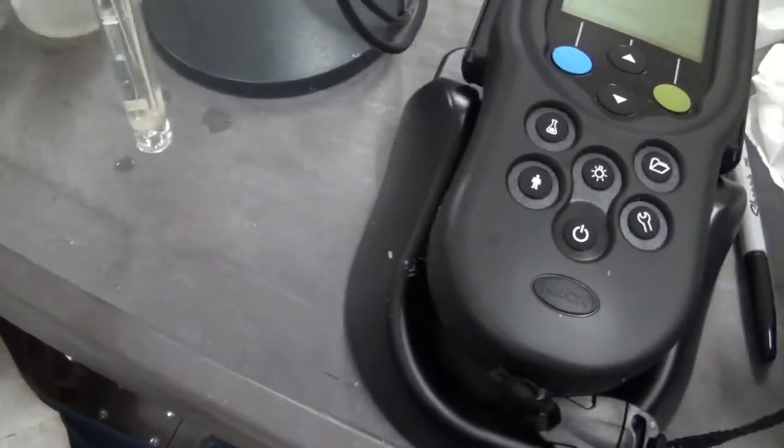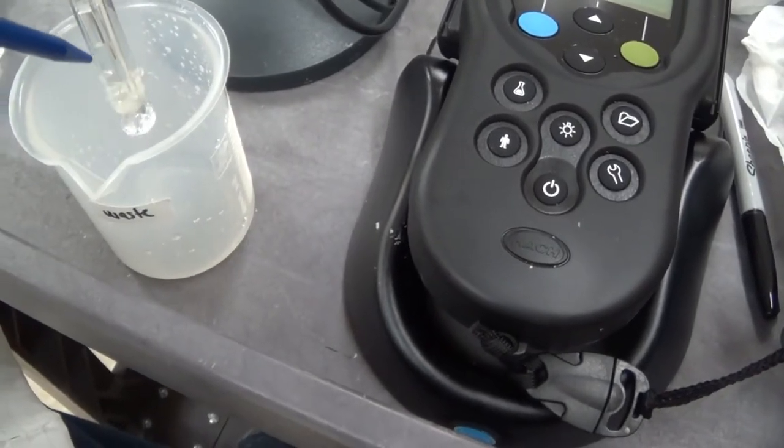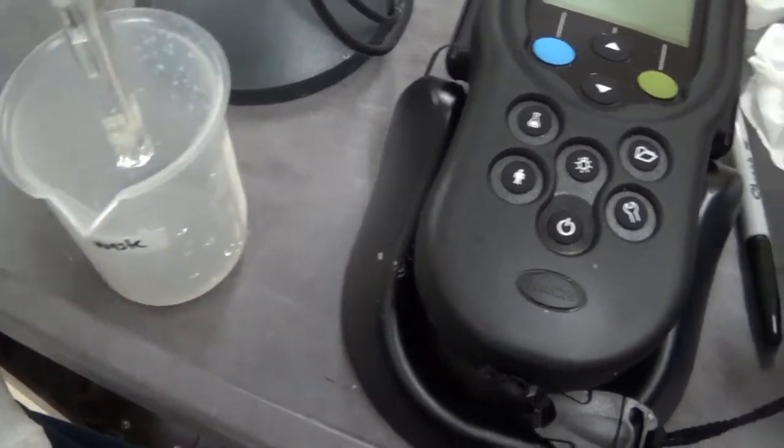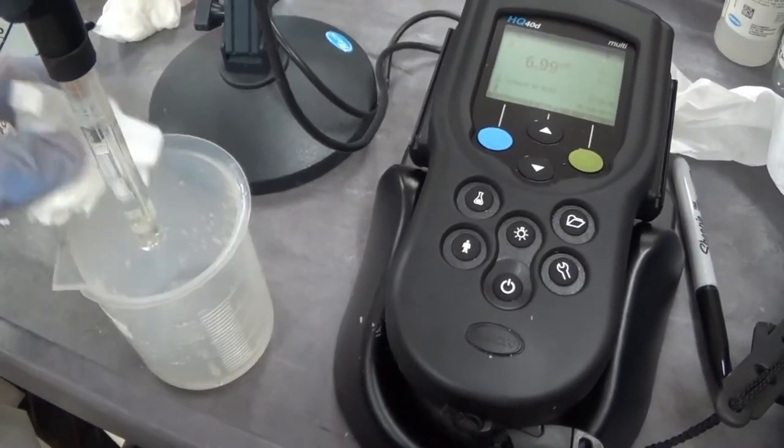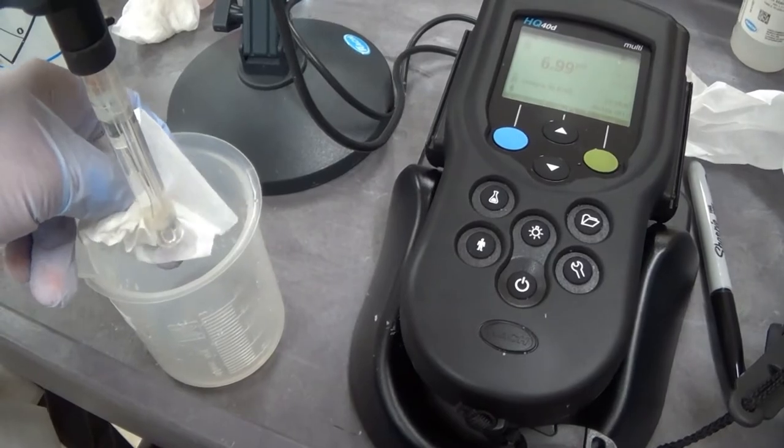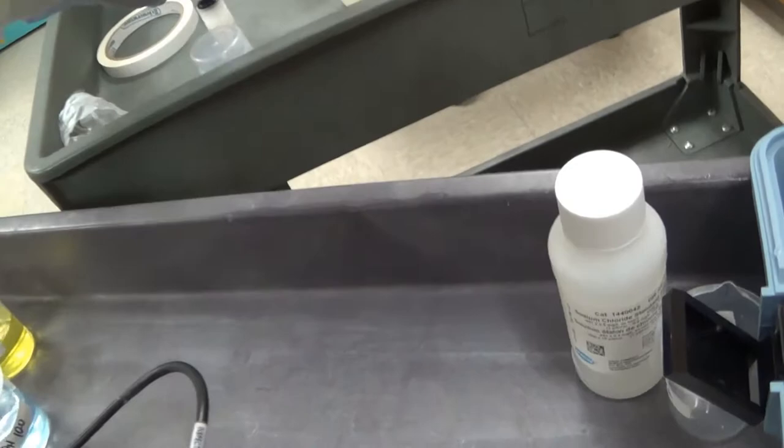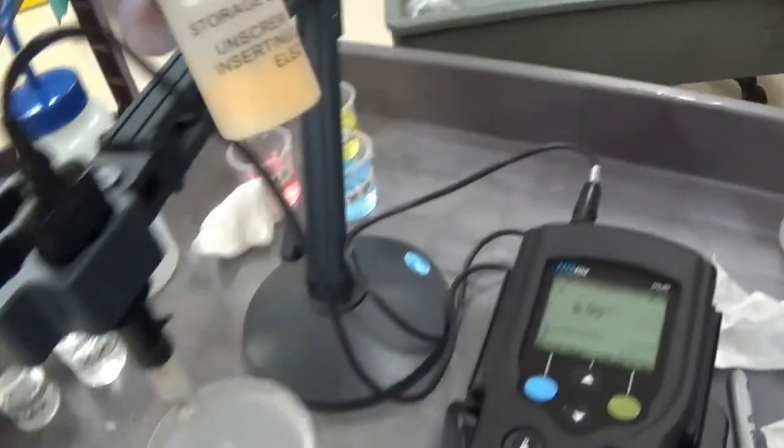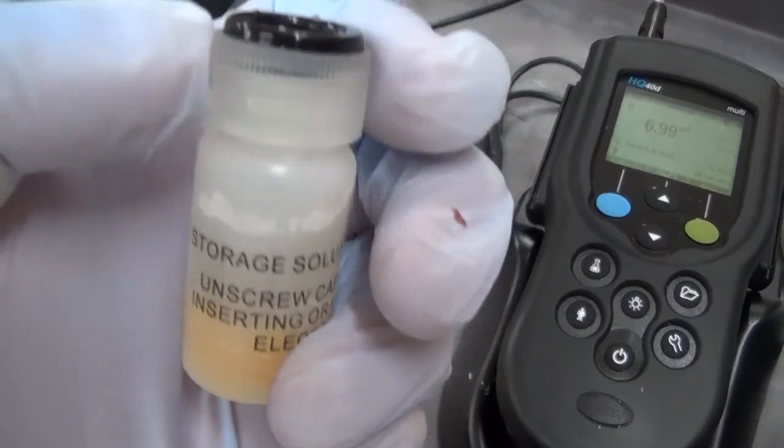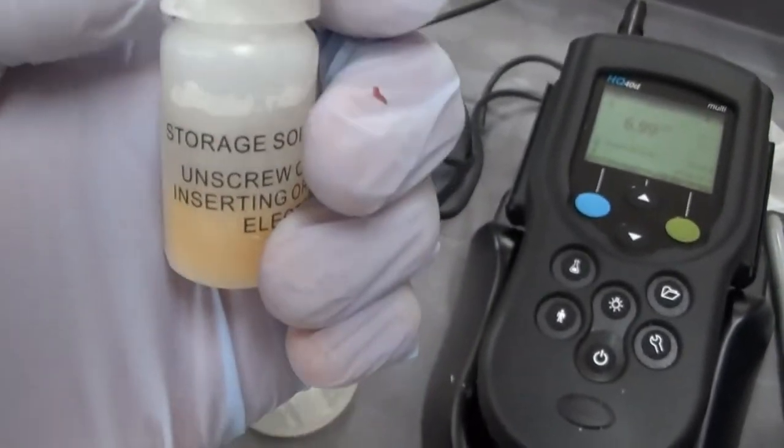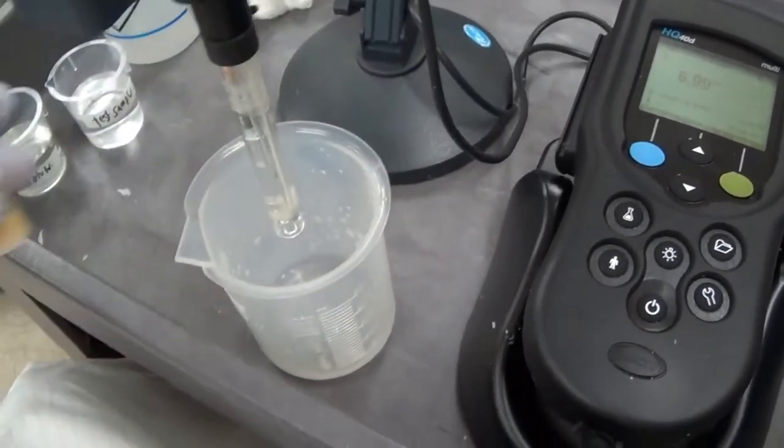I am now going to rinse off the probe, let it dry, and put it back into its little storage container and parafilm it. I am going to loosen this up so it is easy to put it in. Then I will tighten it up and parafilm it. We are done with the pH section.